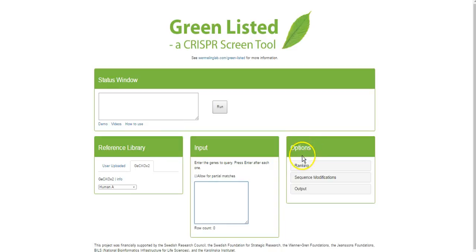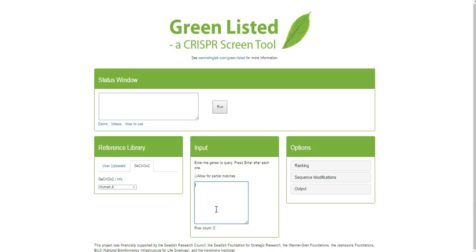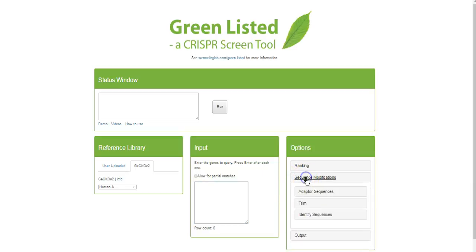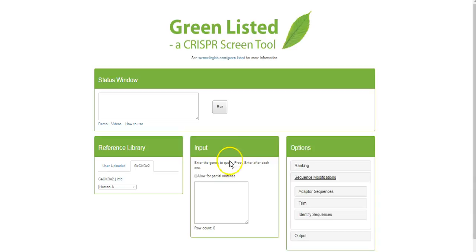As mentioned, there's more information in the how-to-use section. In the options section you have the possibility for some ranking, some sequence modification, and so on. The most important part is the sequence modification, because as you input a list of genes the software will identify a number of spacer sequences — or gRNA sequences — that will target those genes. But to actually make a CRISPR library you need to clone these into some kind of vector or plasmid, and for that you need adapter sequences.